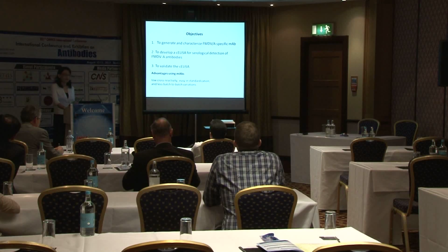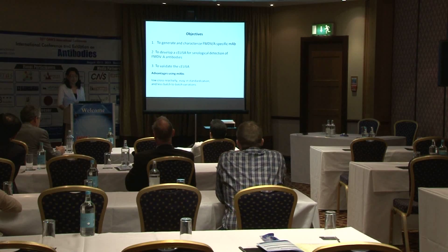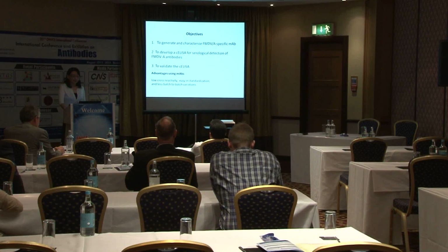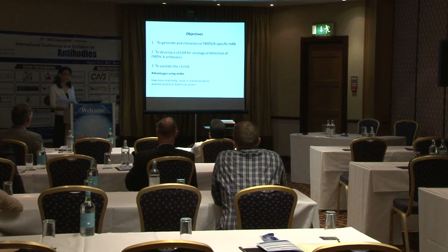So the objective of our study is to generate and characterize FMD serotype A specific monoclonal antibodies. In the meantime, we use those monoclonal antibodies to develop a competitive ELISA for serologic detection of FMDV serotype A antibodies, and also to validate this C-ELISA. Actually, for competitive ELISA, we can use polyclonal antibodies, but polyclonal antibodies always show high background and cross-reactivity. So we decided to use monoclonal antibodies.